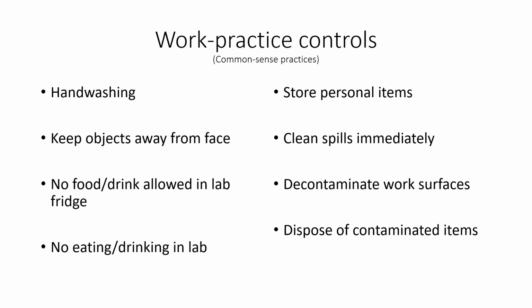There are certain things we don't want in the laboratory, such as food. We don't want any drinks in the laboratory refrigerator. We don't want any gum. There should be no eating or drinking in the laboratory. No smoking, no vaping, and things like that. We just don't want to expose ourselves to anything that could get in our mouths. We want to store personal items. We have the cubbies that you can store your book bags in, and we want to do that so we're not bringing those personal items into the contaminated laboratory.